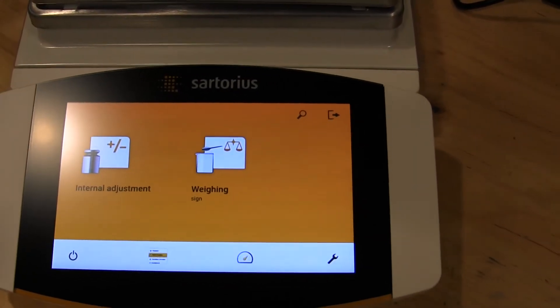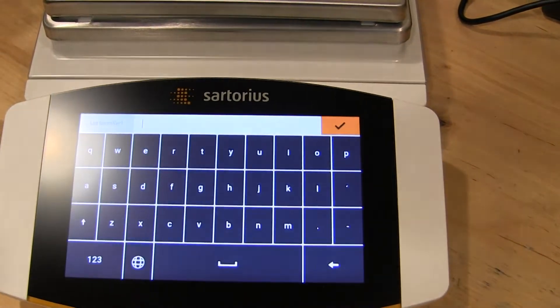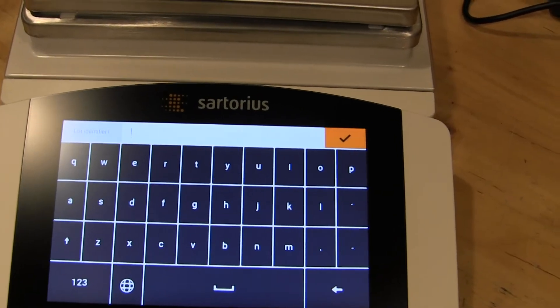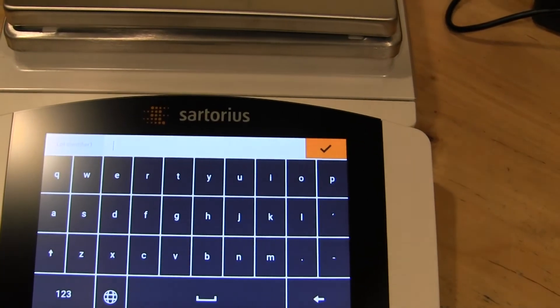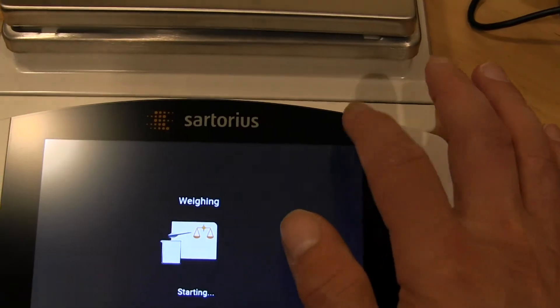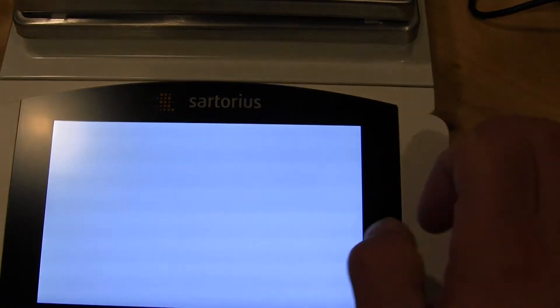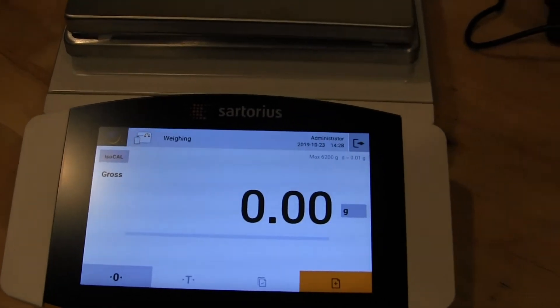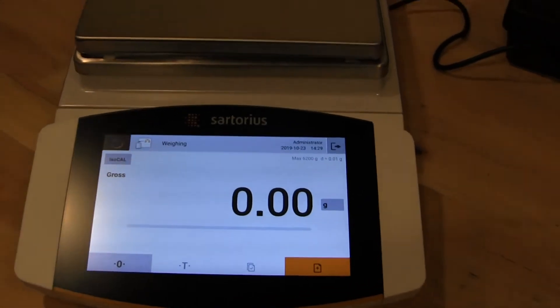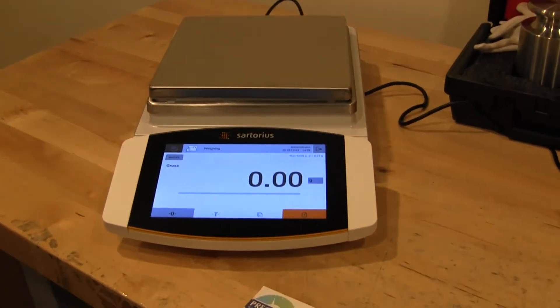From here we can go into weigh-in. This has a custom profile where it's looking for user identification and there are about five settings. I'll just leave them all blank. Once I'm in the weigh mode, I can put on some weights and we can see how this balance performs.